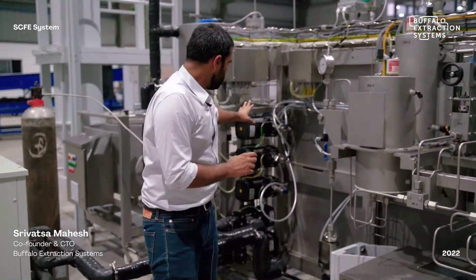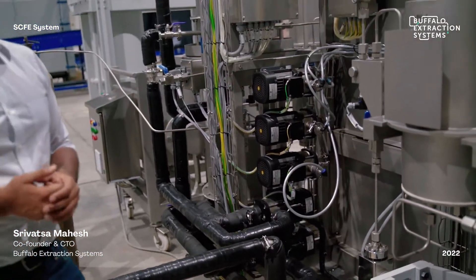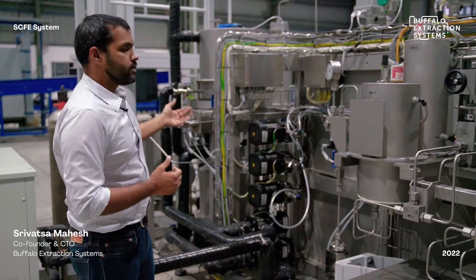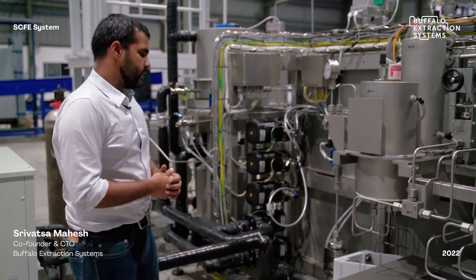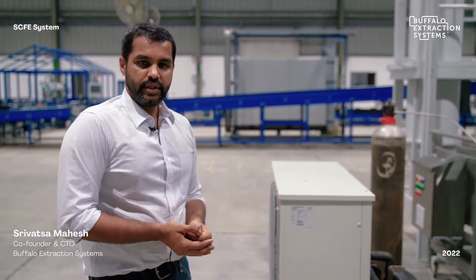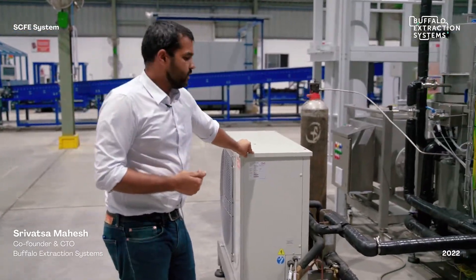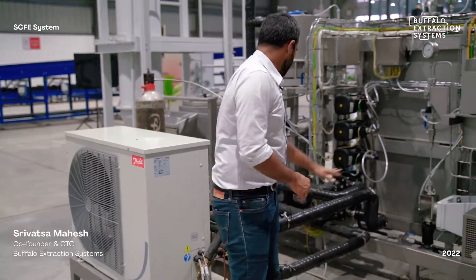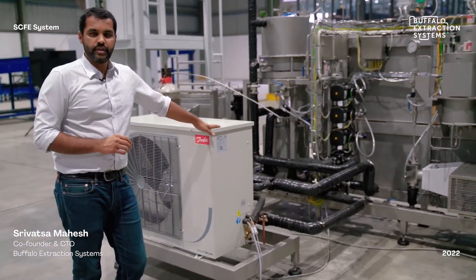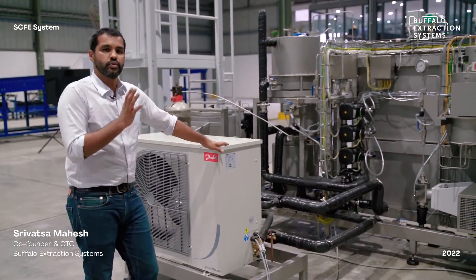The utilities also include recirculation pumps used for heating the superheater or separator jackets, or cooling the condenser or superchiller. All pumps circulate glycol — the thermic fluid — through the condensing unit, which is the chiller, typically located in your utility area. The condenser uses R404 as a refrigerant, enabling precise control of glycol temperature and in turn the CO2 temperature.